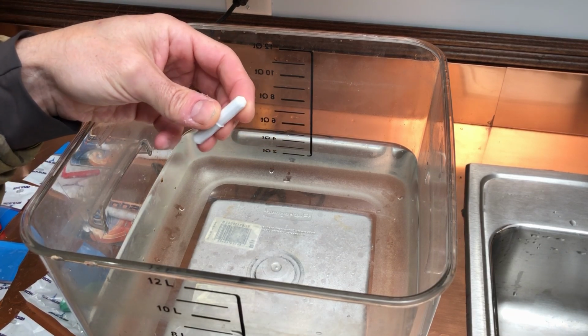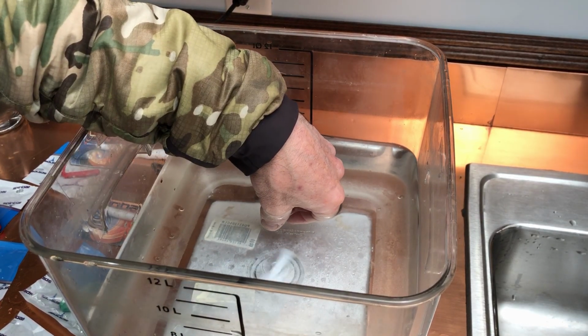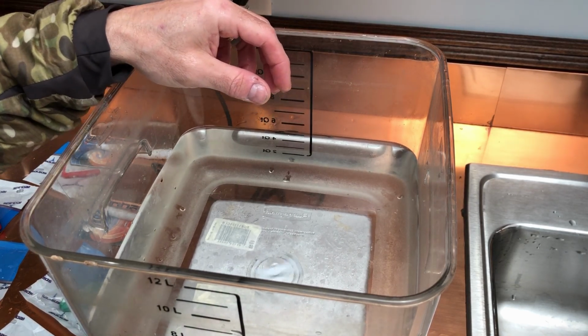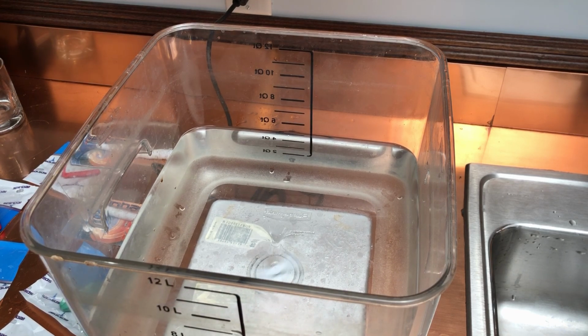This is a 2-inch Alnico 5 one. It is about 50.8 millimeters. It's actually hard for it to stir well. I believe it's because this type of magnet is not that powerful, but it's fine if you need a lot of these or you don't have a really demanding application. You can see there's a vortex forming. And this stirrer has a 20-watt motor. I'm barely using any of its power right now. It's only on about 15 or 20% of its power.